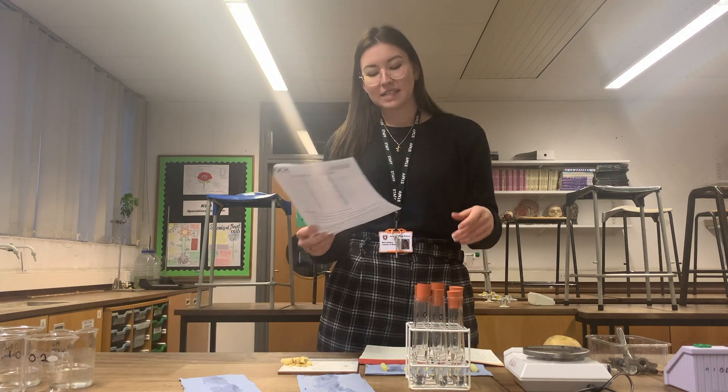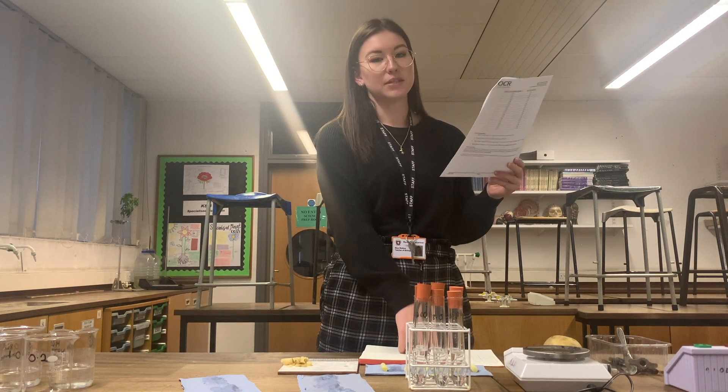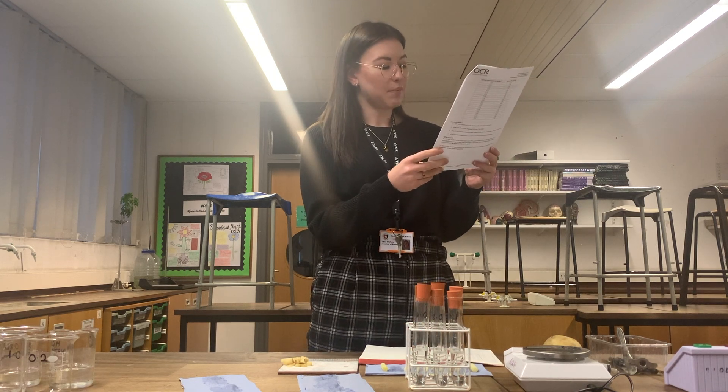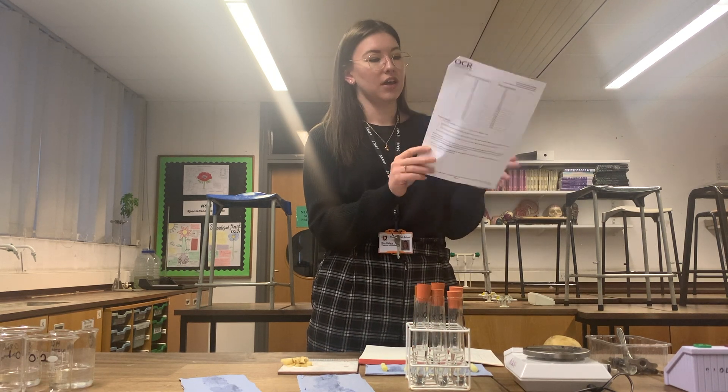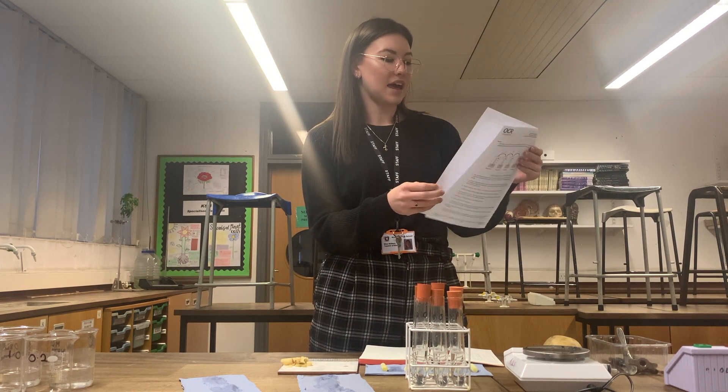All that remains now is steps 10 and 11. Step 10 is to calculate percentage change and record it in your table, and step 11 is plotting a graph. After that, there are four extension questions at the end of the student sheet, so it's over to you.